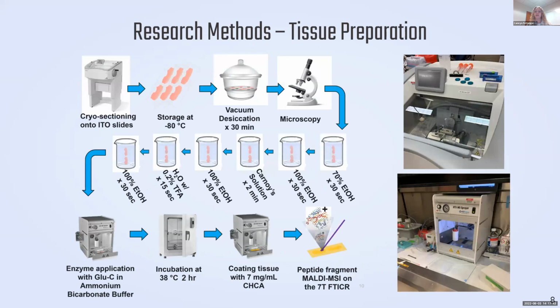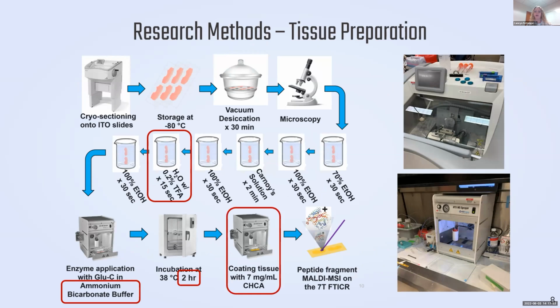So this slide is a bit of an overview of the many steps that it takes to prepare our tissue. And I'm just going to highlight a couple here that we ended up modifying and we saw improved results with.